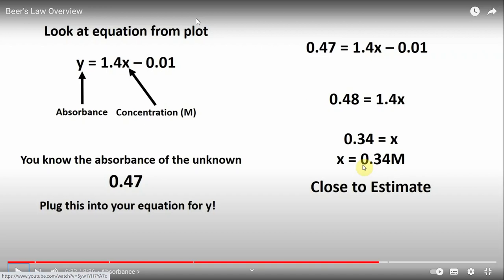You're supposed to put in a blank cuvette first that just contains your solvent, so that it takes into account any background absorbance by the solvent or the cuvette itself. So the y-intercept should be 0, but sometimes, because life isn't perfect, it just isn't. And we just live with it.